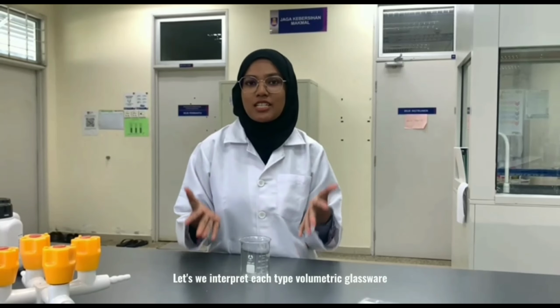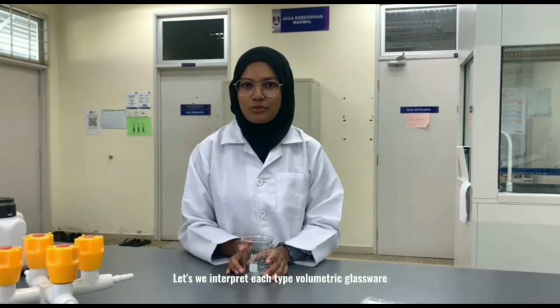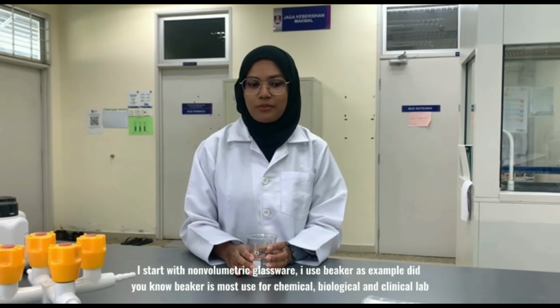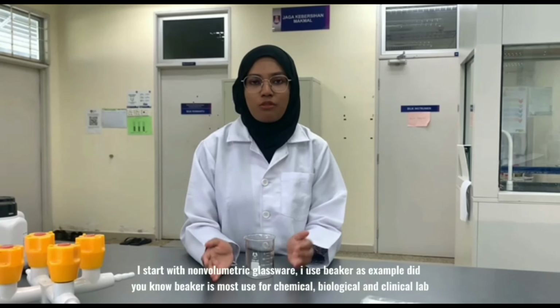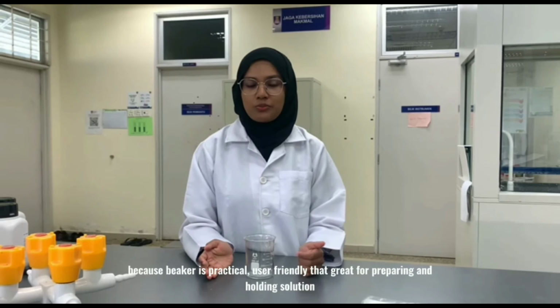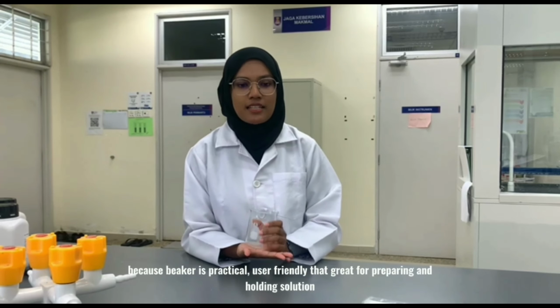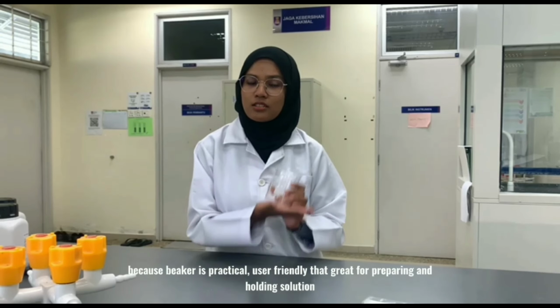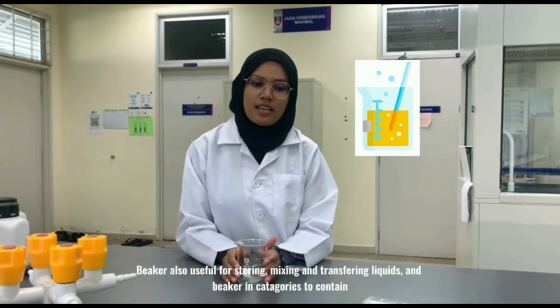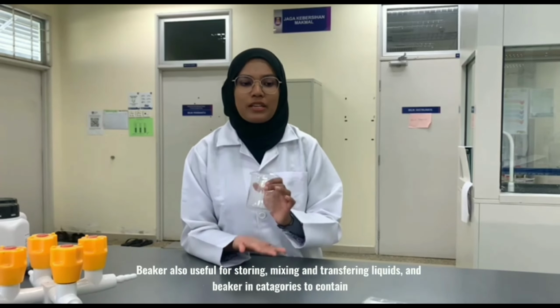Let's go through each type. I start with non-volumetric glassware. I use beaker as example. Did you know beaker is most useful for chemical, biological and clinical labs? Beaker is practical, user-friendly, and great for preparing and holding solution. Beaker is also useful for storing, mixing and transferring liquid, and beaker is categorized as to contain.